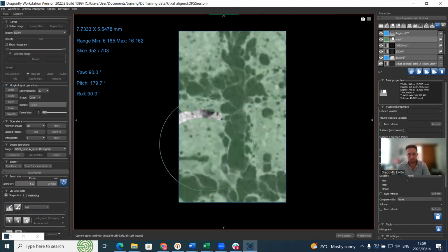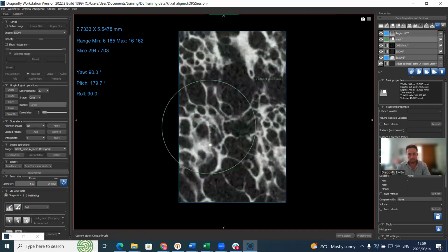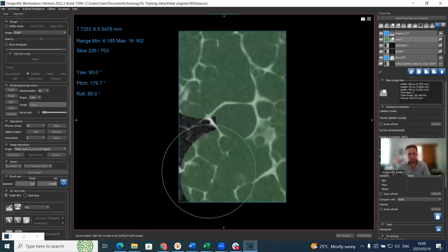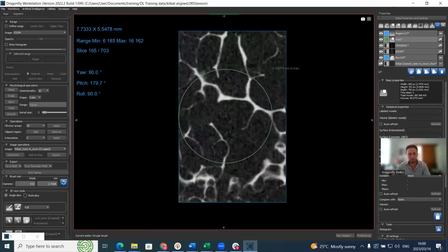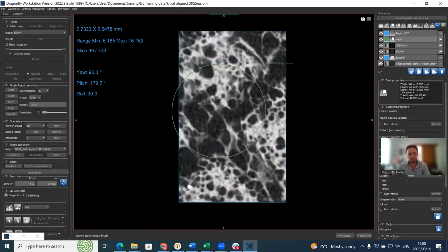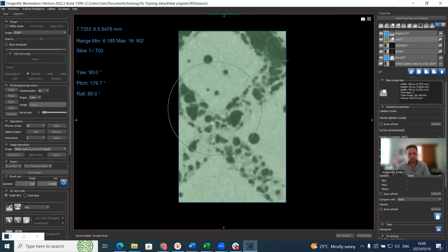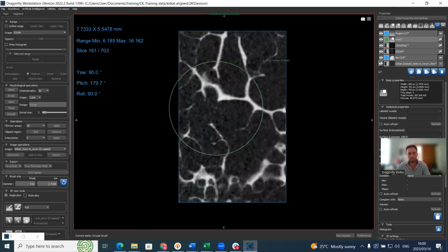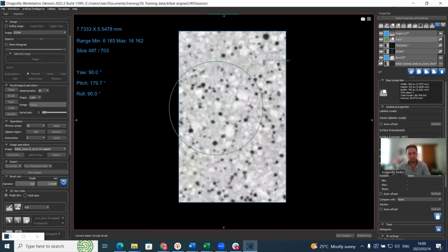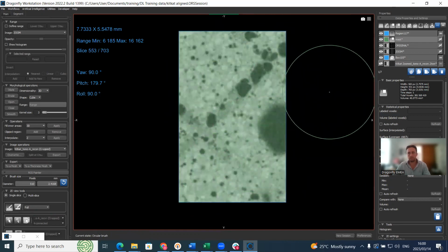So we select this. Three, 4, 5, 6. There's another 7. Okay, so we've got 7 slices.